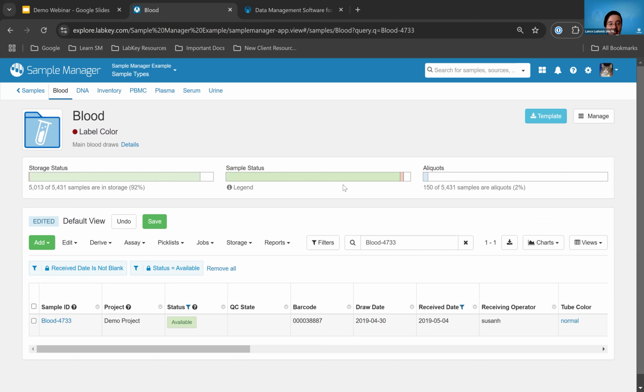Yeah, so we could definitely talk about support for uploading historical data. Usually those sorts of databases can either be done through an API or you can get them into a spreadsheet. So we can help with that. We've been able to help with a wide variety of former databases, and that is included in the support. So we can speak more, look at what that data would look like and go from there. But that's a great question.